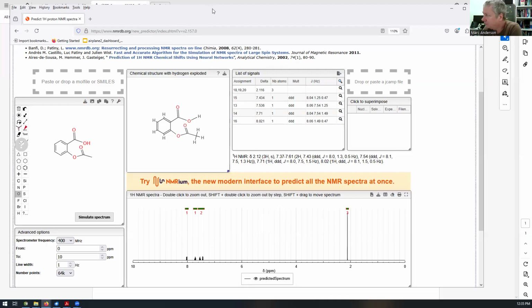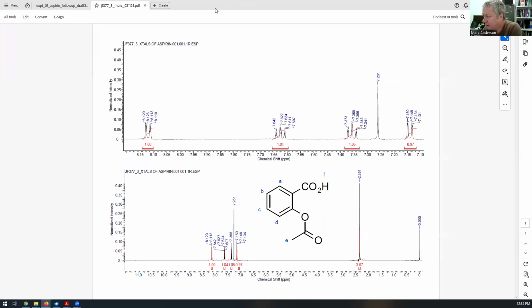I'm going to maybe click back, and you can see basically the 4 signals on the left. 1, 2, 3, 4. This 7.2 is chloroform. It's the solvent. You can kind of ignore that. There's also the signals here at 7.2, mainly the 4 aromatic CHs, and then we have the CH3 at 2.3. Okay, let's go back to the simulation now.